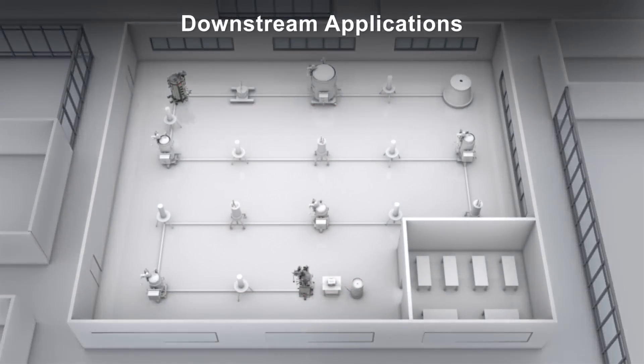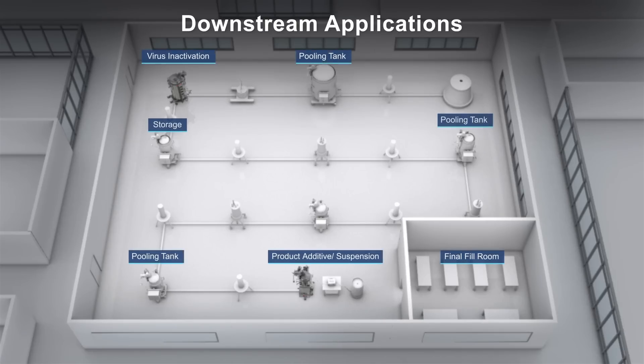For downstream workflows, the next-generation Thermo Scientific Hyperforma SUM is well-suited for critical steps such as pooling, viral inactivation, storage, and final fill product suspension.